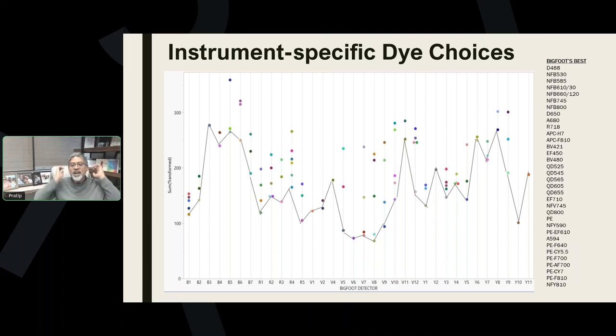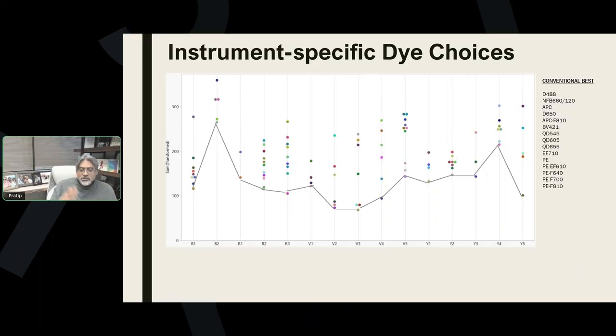The other thing that we're not considering here is what markers are available on these dyes, and we're not considering some of the characteristics of these dyes, which could be important as well. Like some of them play well with intracellular staining while others don't, and that's not folded into this. And so there's certainly more consideration that you have to do.